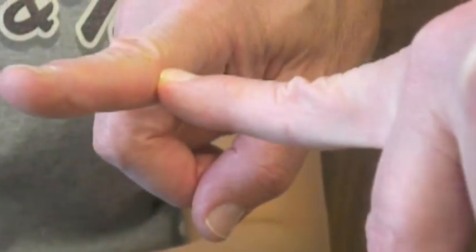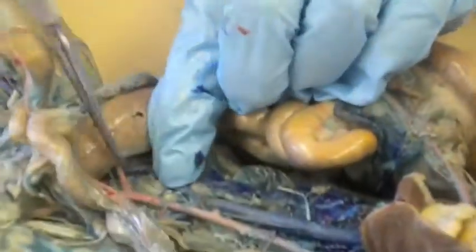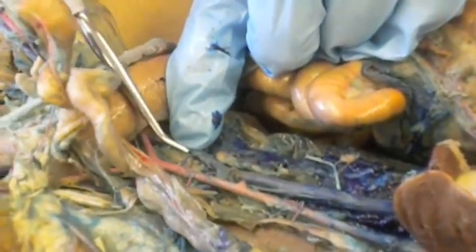And then what you have to find is where does the internal come off of it. So here's the before. This is common. Here's where the internal comes off. So that's common. This is going to be external iliac. And then the deep femoral comes off, and then it's femoral. Okay. So this would branch off right here. Yeah, it's internal, and after that it'd be external. Yes. Okay. So on your cat, this is branching off pretty high up in the body.